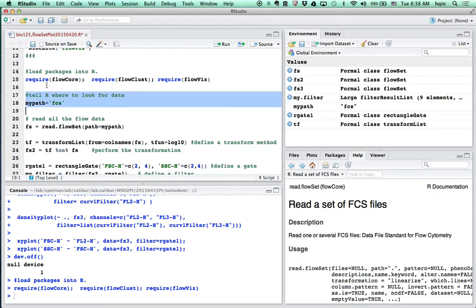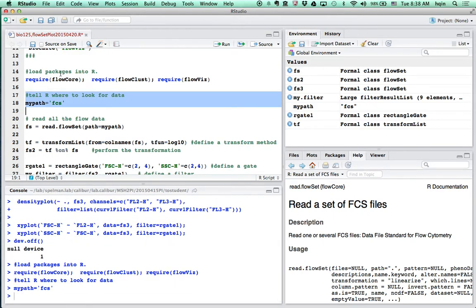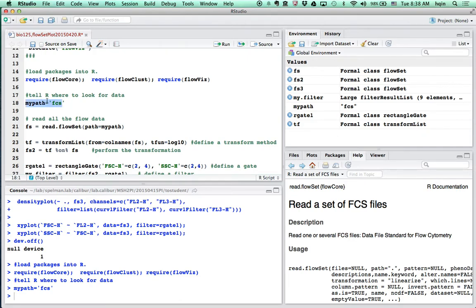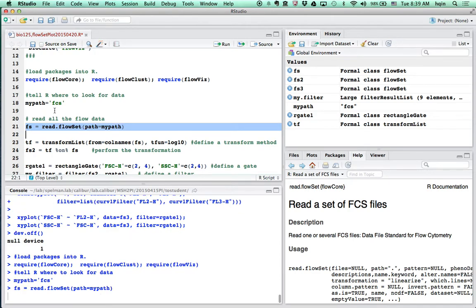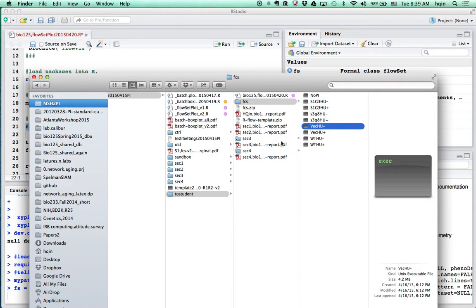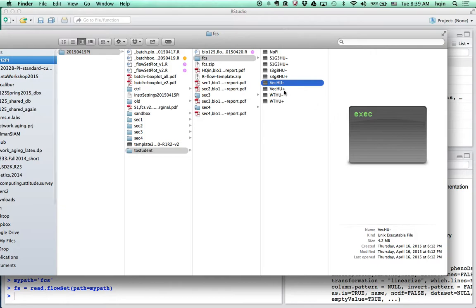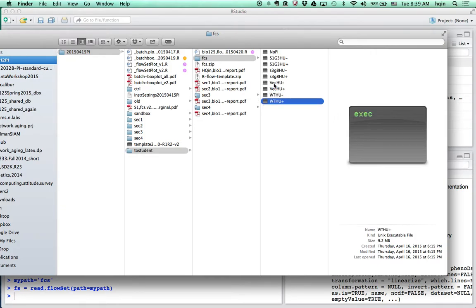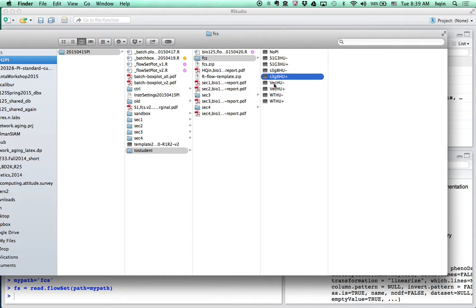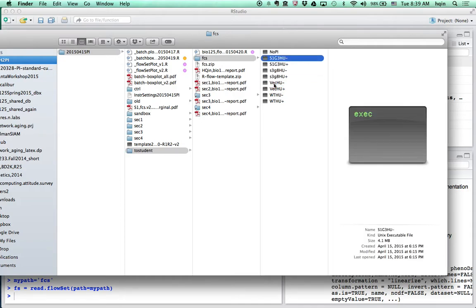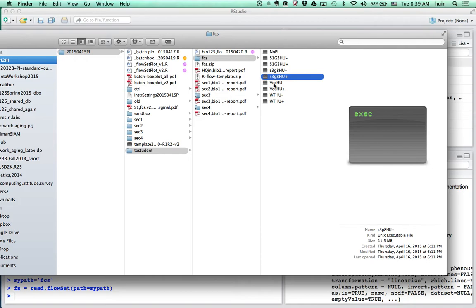We need to tell R where to find those flow cytometry data. So I'm setting the working path, you go to fcs. And then the next line will read all the fcs data into R. This takes a minute. This is because once you go to the fcs folder, you will see each flow cytometry data is a few megabits. So it's actually quite large. Each one, 5 meg, 8 meg, 7 meg. It's actually quite a large file.